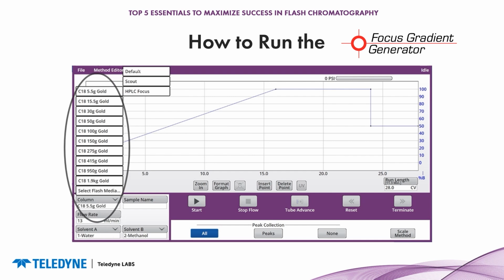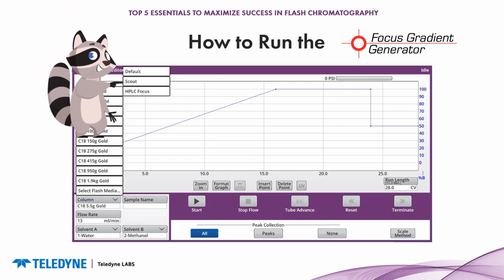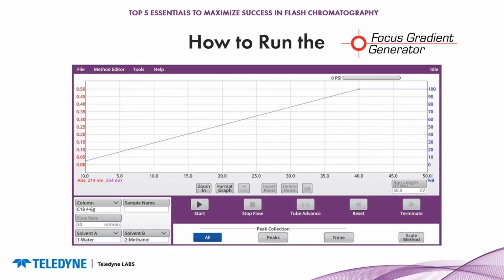So once you select which column you're going to use, you want to select the Scout button, and that's the one that Ready is pointing to right there. You don't want to select default, you don't want to run HPLC focus, you want to run Scout. So once you select Scout, a gradient should pop up, and that's going to be from 5 to 100% solvent B with 100% isocratic hold at the end there.